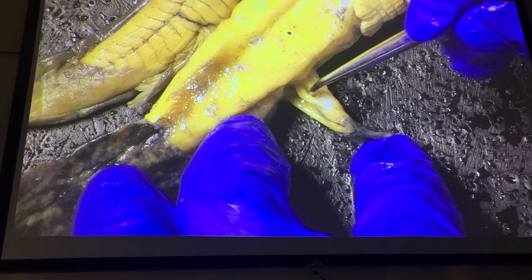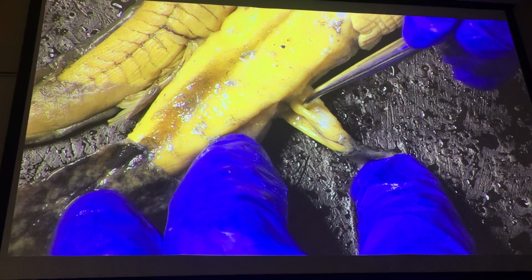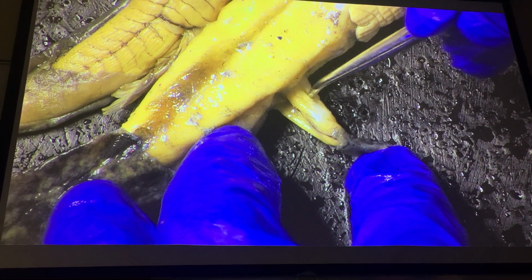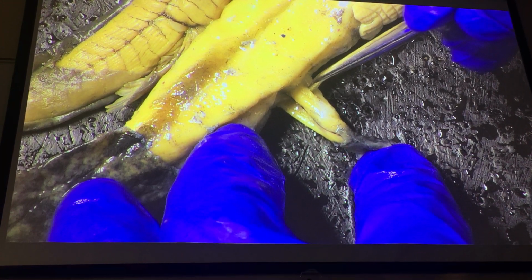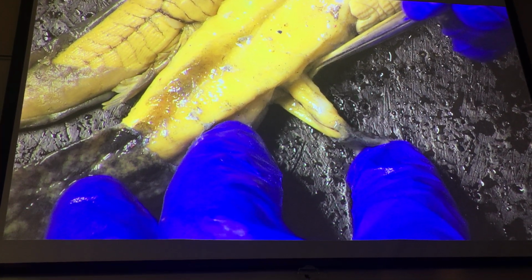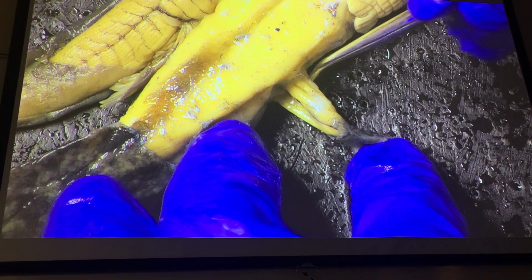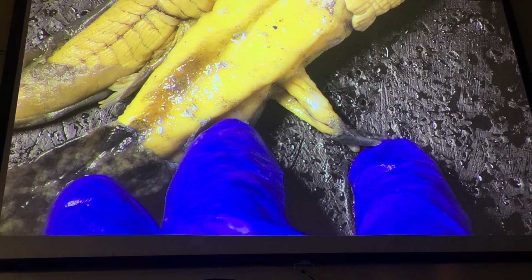The first ilio, iliotibialis. Then ilioextensorius. And the most lateral one, like the more lateral of your two shin bones, iliofibularis. Okay? So if you want to think about it this way, F-E-T. Fibularis, extensorius, tibialis. Feet over the feet. It's stupid, I know, but if it works.